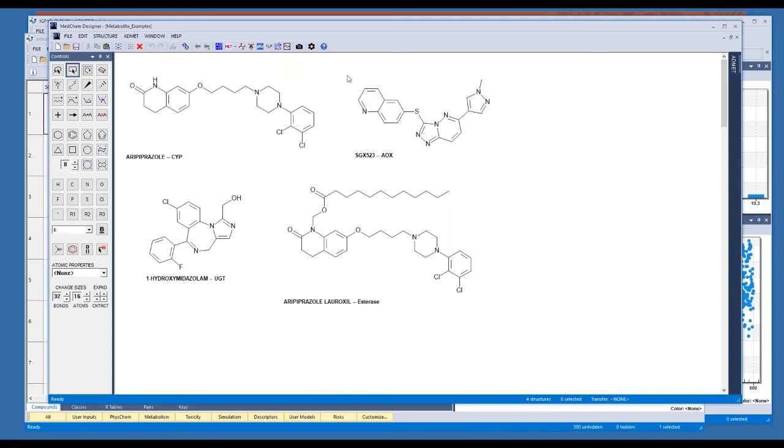So just briefly, I'll show these features. This is a compound that entered phase 1 clinical trials and failed in the trial due specifically to AOX metabolism. The metabolite led to, I believe, kidney failure. So now if I expand this button, you see that the default option is now called CYP/AOX.